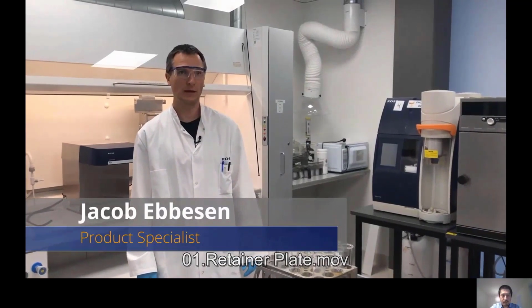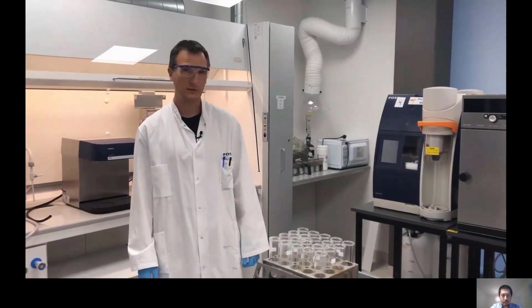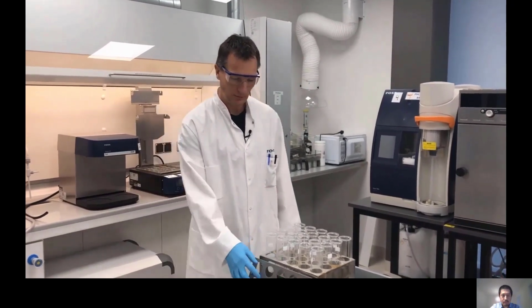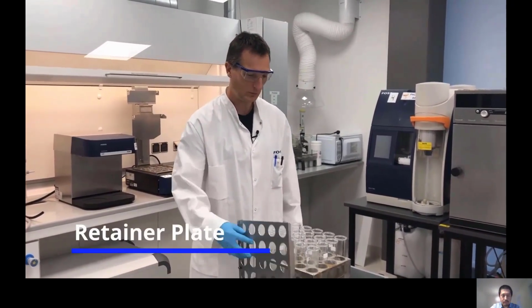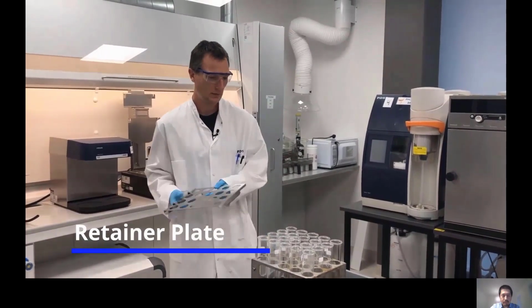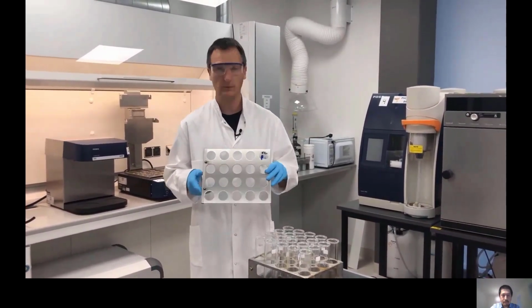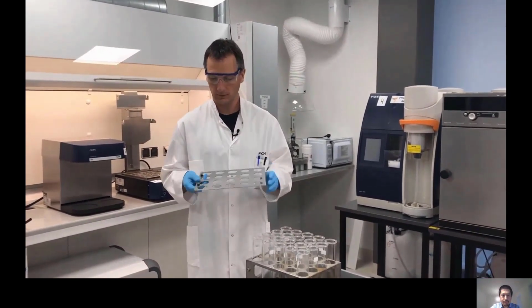Hello, my name is Jacob. I'm a product specialist for the lab segment at FOSS. And today I'm going to show you how to use a retainer plate for cleaning of the tubes for the Kjeltec system. This is the rack for 20 samples, and here we have a retainer plate.